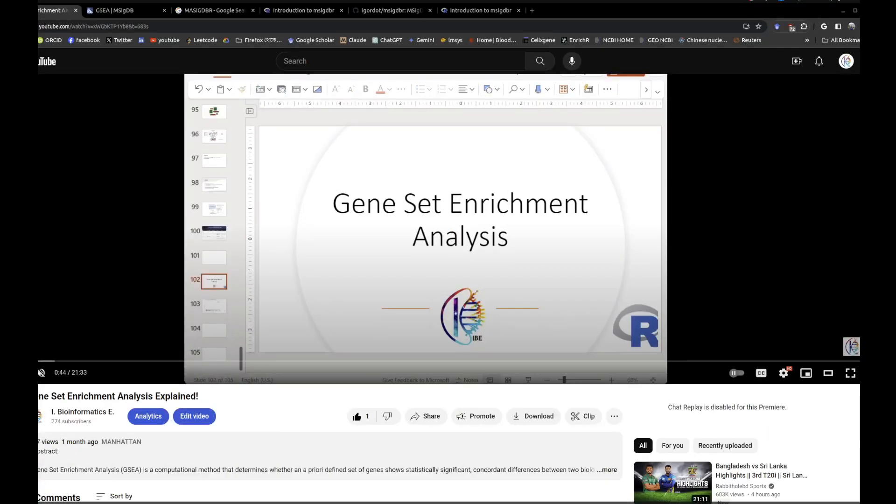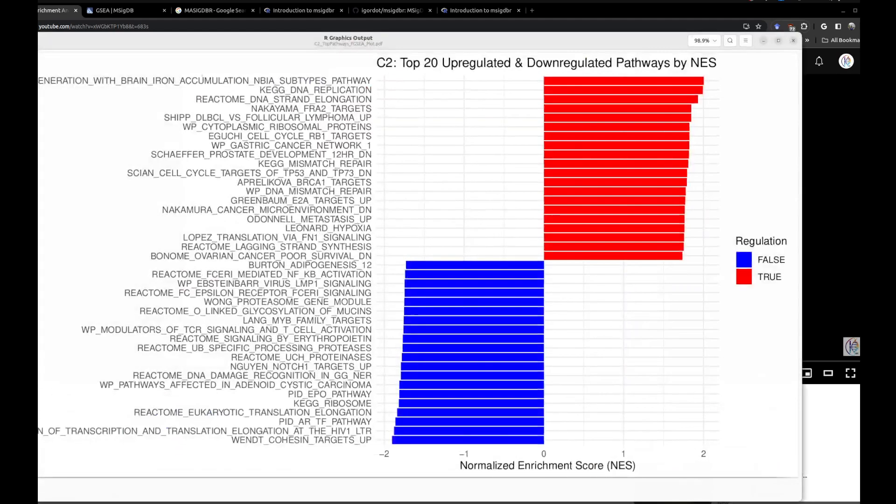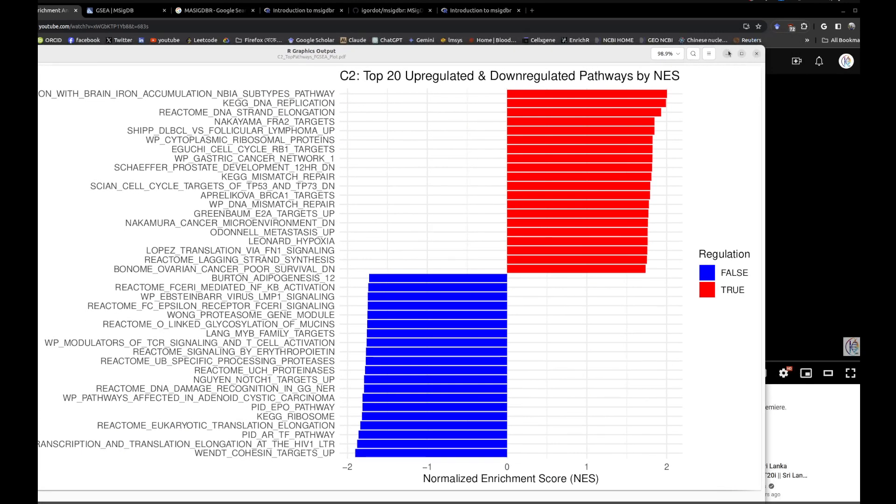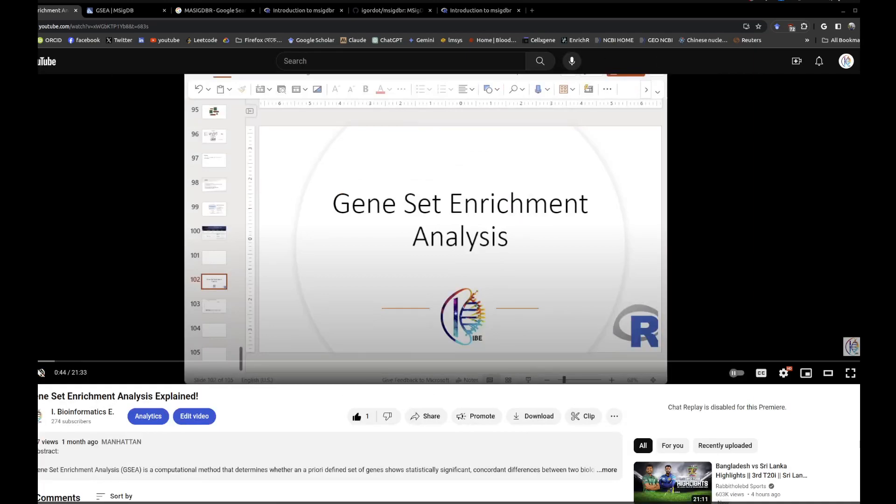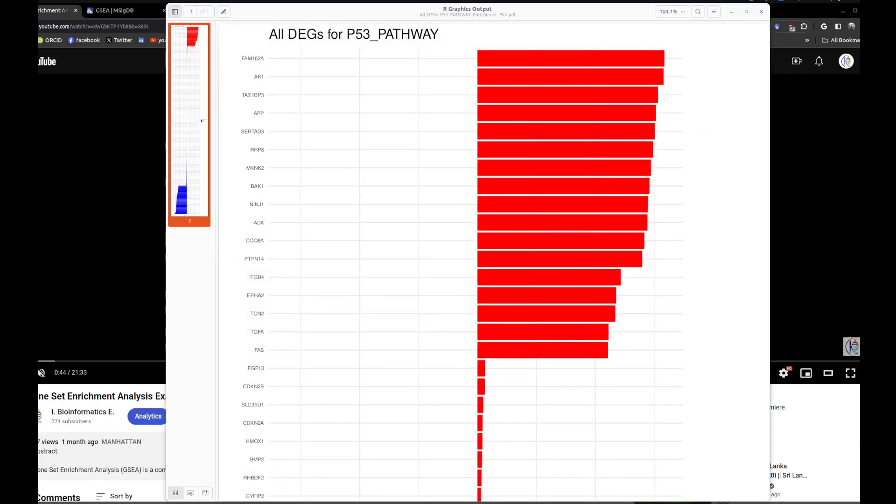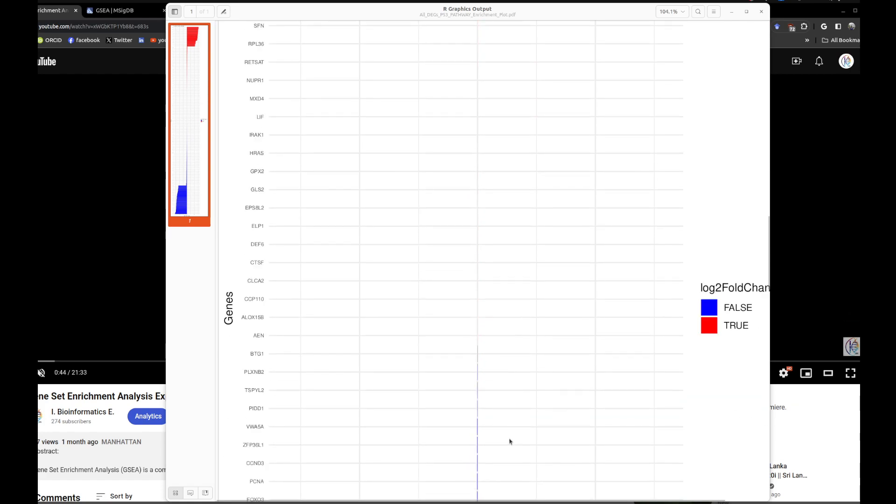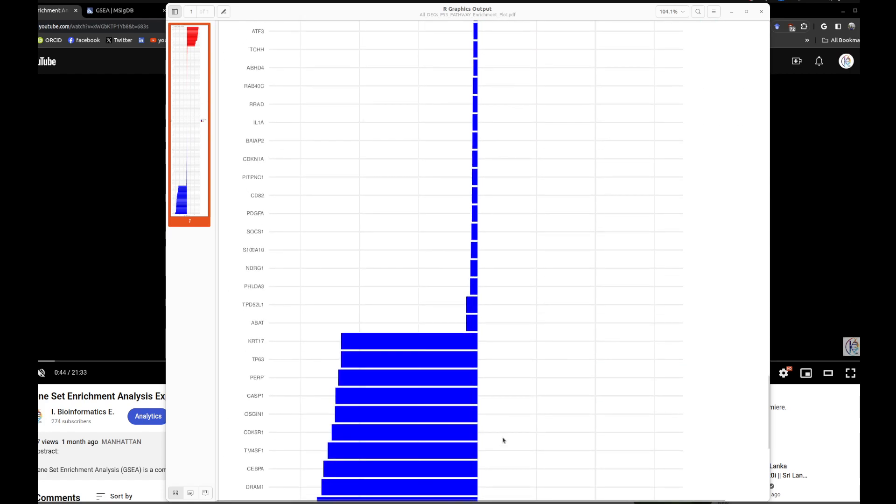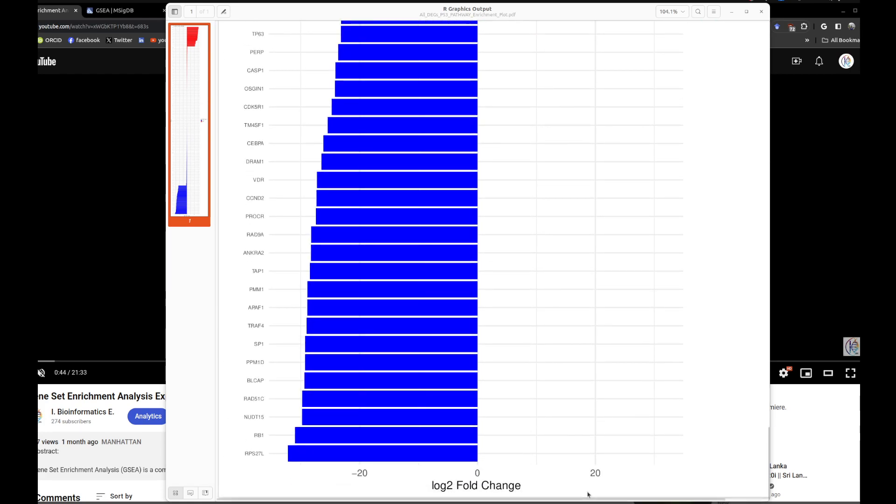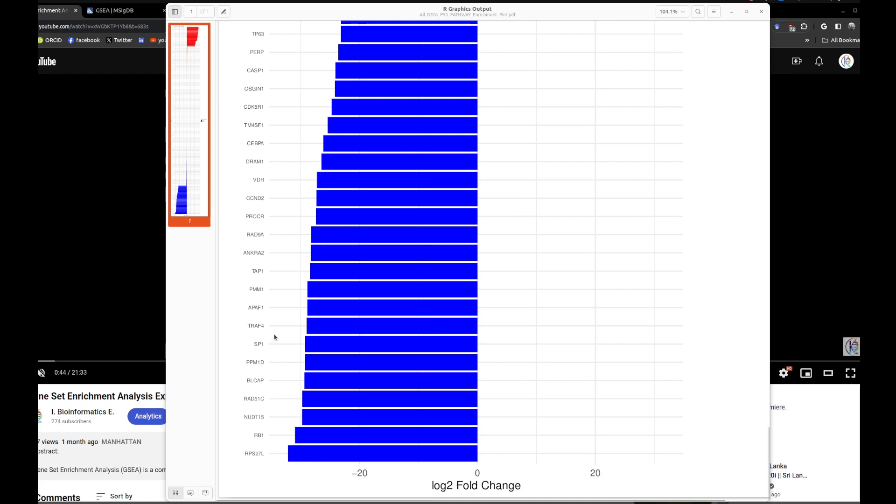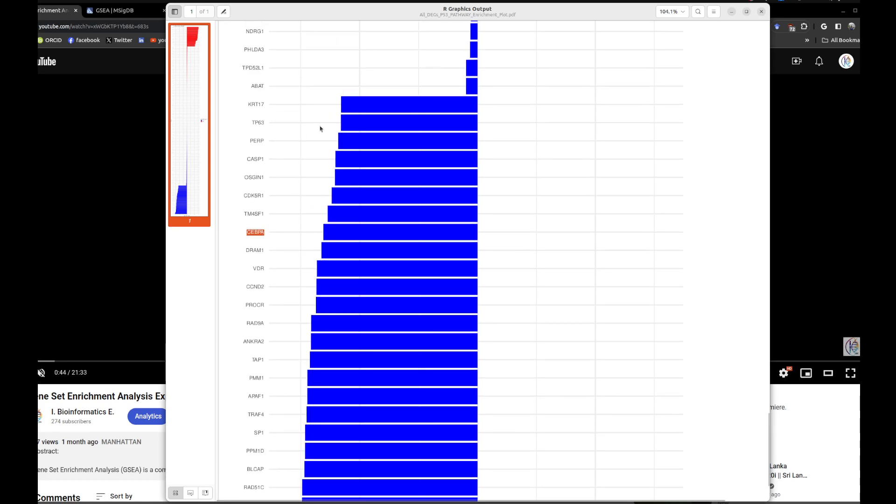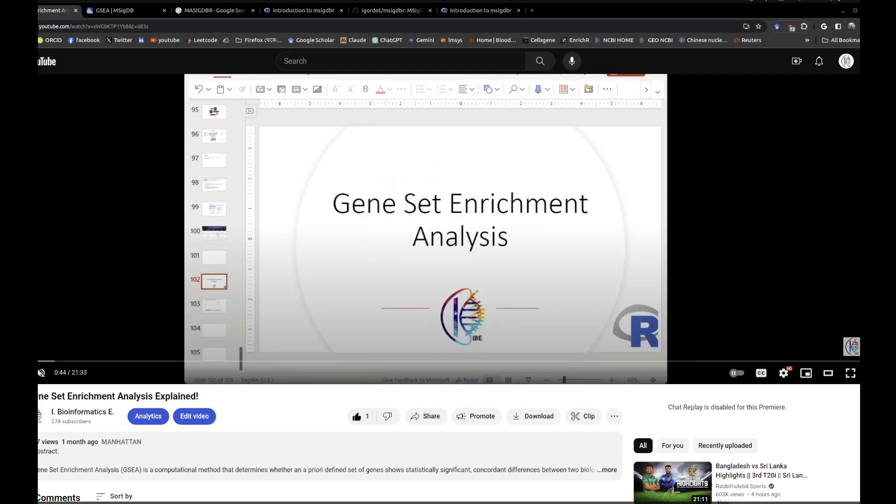Now you want the specific pathways to have the corresponding - what are the genes belonging to this specific pathway? For example, you're interested in p53. So you can write code to specifically look at the log fold change of the genes that correspond to this specific pathway and present with your differentially expressed gene list. The examples could be this, or CBPA, and many of them.